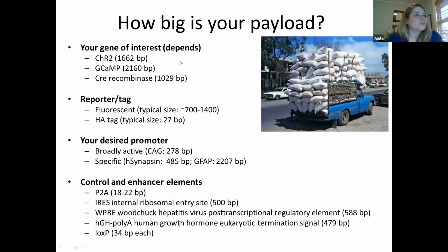So how big is your payload? This is a truck that's obviously way exceeding its payload. This is going to be a practical concern for what you're choosing, HSV versus lenti, and so on. This especially comes into play if you want to use AAVs, because you do have limited space in your AAV backbone. So I just wanted to give some insight into how large some of these constructs can be.